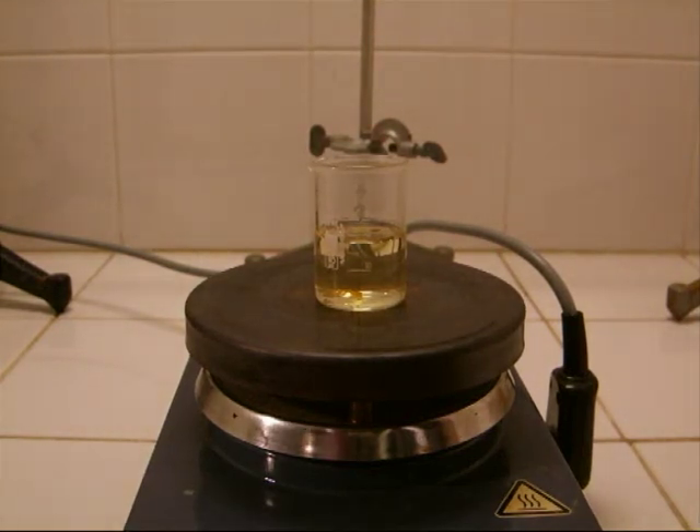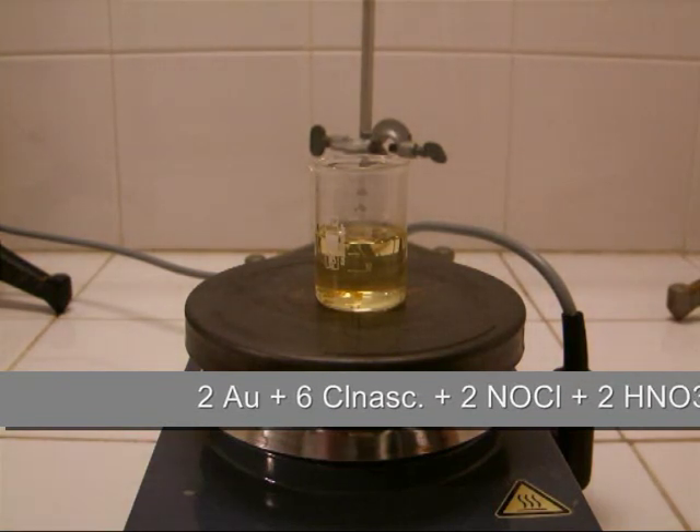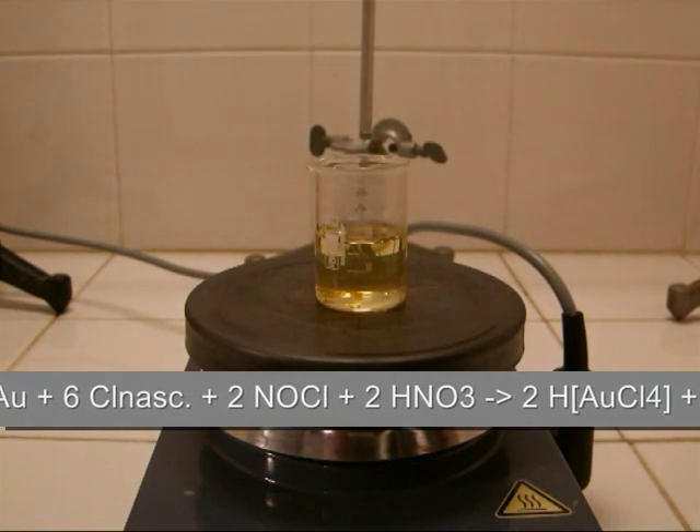Now you can see the mixture turning yellow, which is caused by nitrous oxides. These nitrous oxides are produced by the reaction of the aqua regia with the gold. Now it's visible that this solution is able to dissolve gold. The reaction of the aqua regia with the gold forms tetrachloroauric acid and nitrogen dioxide.